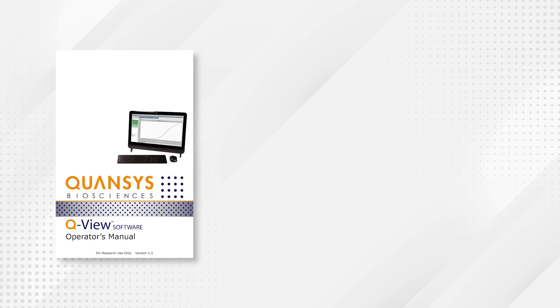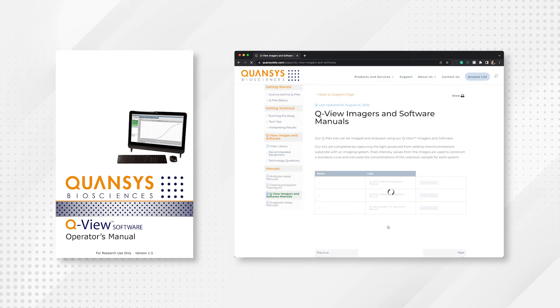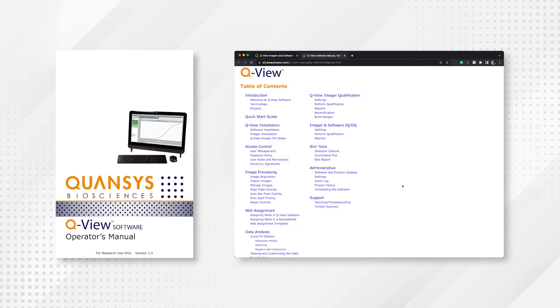For help installing QView software, a printed copy of the software manual was included in the box with your QView Imager LS. An online version of the software manual can also be found in the support section of the quansysbio.com website.